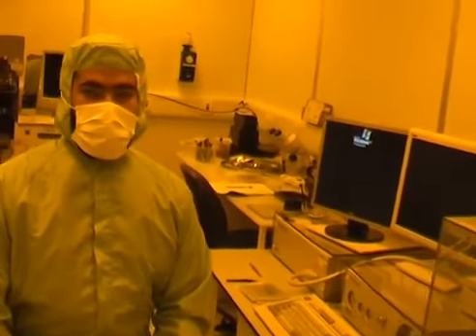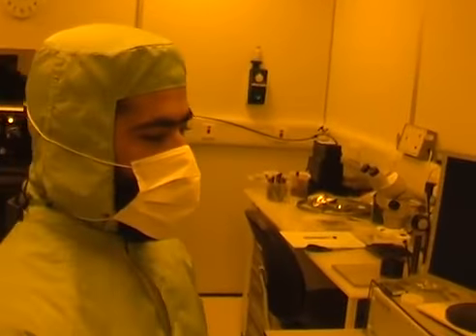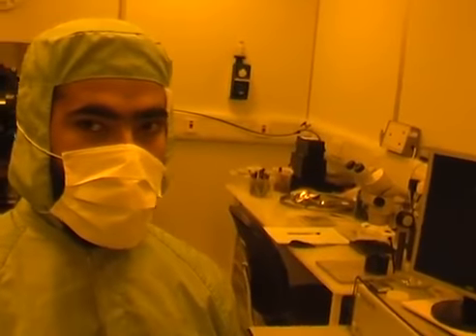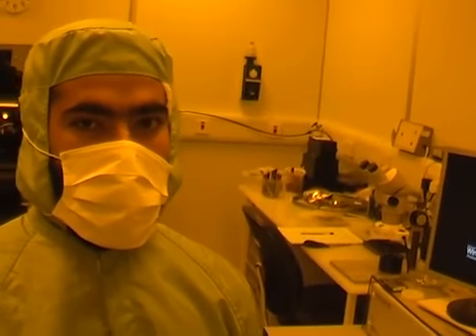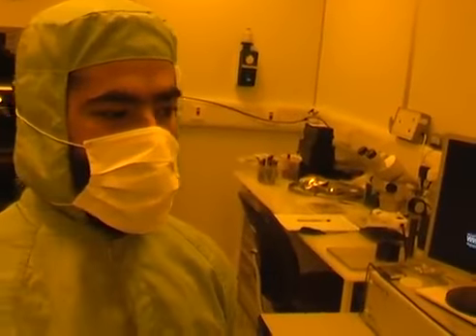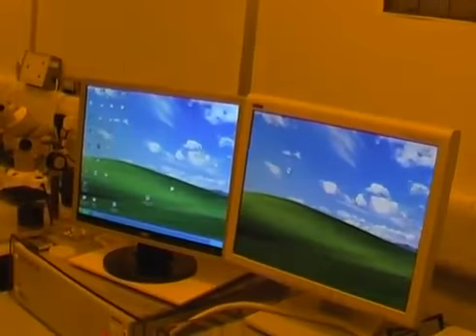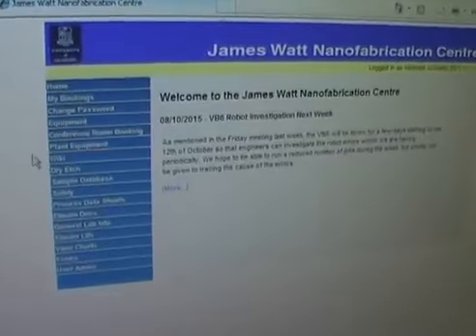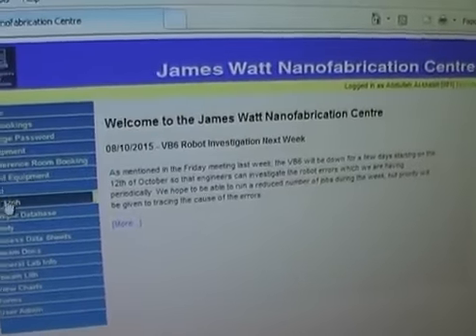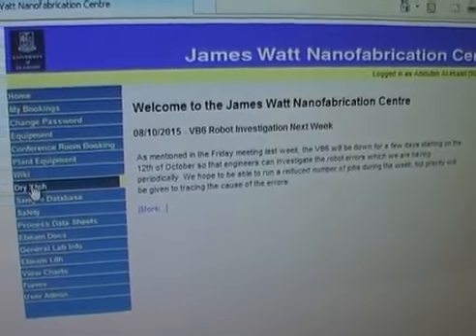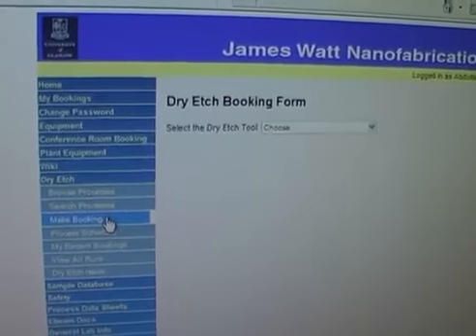After preparing our sample for a dry-etch run, we find a PC and log into the JWNC website to submit the dry-etch and make a booking. We log into the JWNC website, go to the dry-etch tab, and make a booking from there.